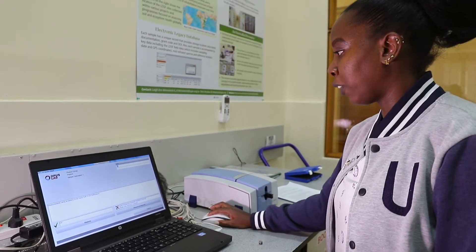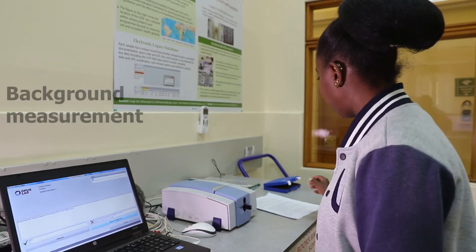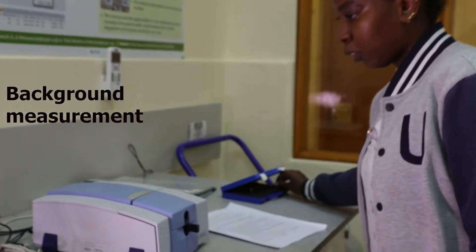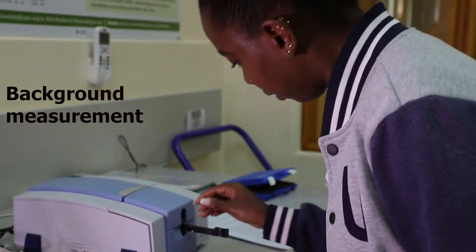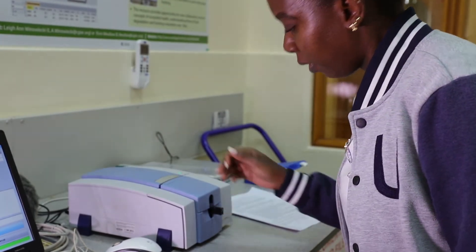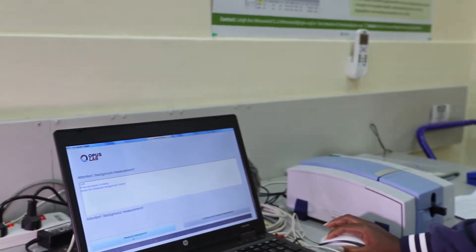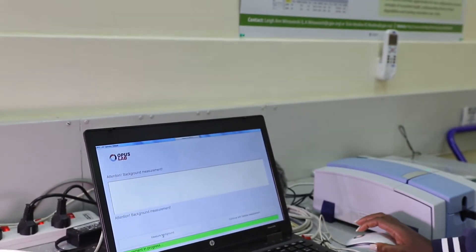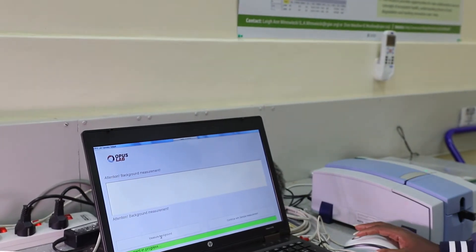Before analyzing the sample, you have to measure the background, which is the reference cup. You place the reference cup in the cup holder, push it back, and then measure your background. It normally takes 32 scans for analysis, which is around 30 seconds, in the OPAS lab.